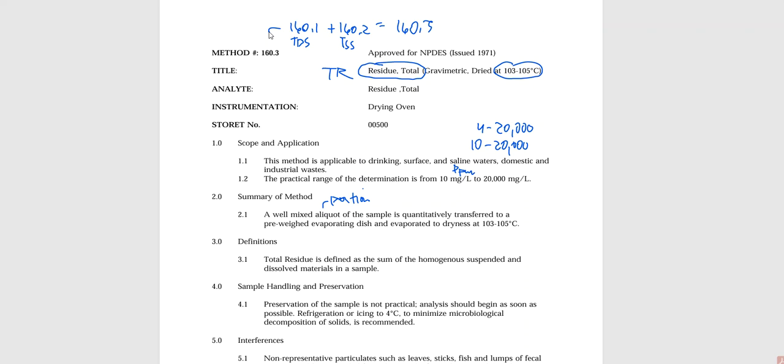It's just simply, let's shake some water up. Shake, shake, shake. Shake your cylinder. Okay, so that's what goes on here. That's what we want to do. So we're going to shake the sample, and we are going to just transfer it into an evaporating dish.